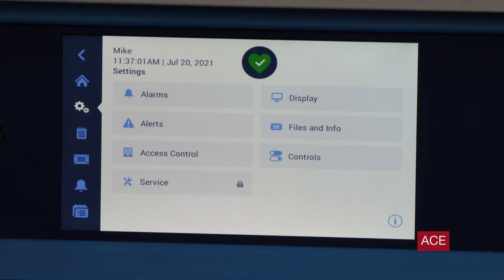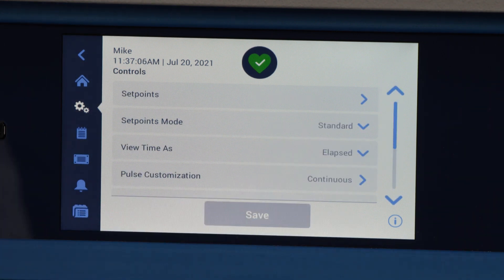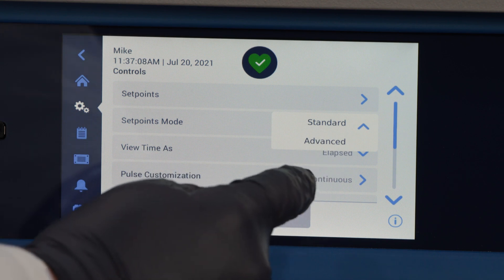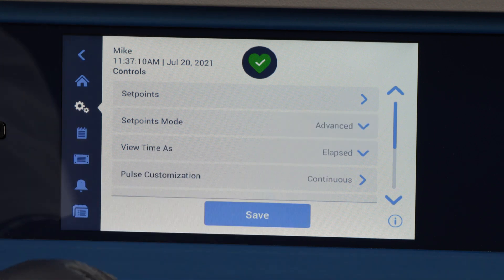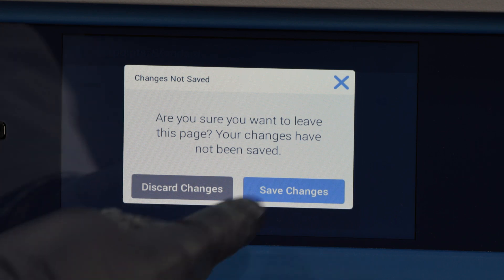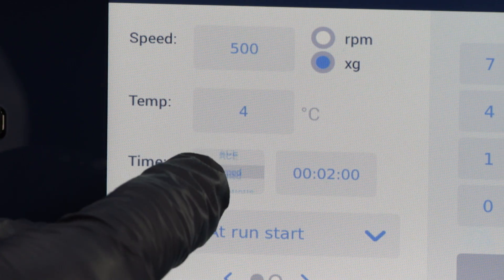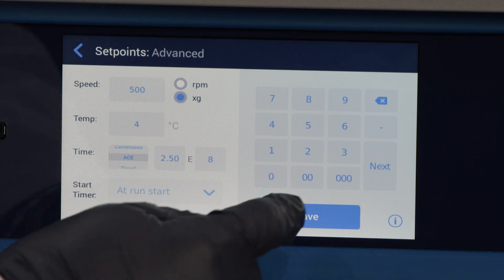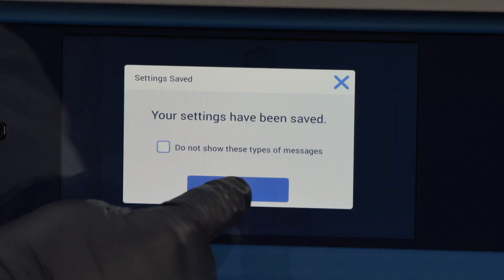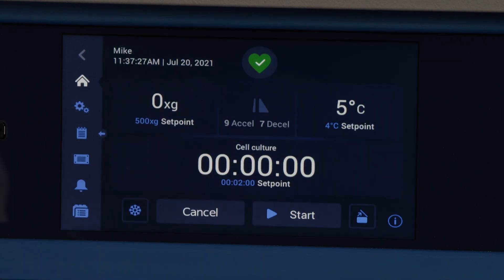The ACE feature is an integrator function that calculates the effect of speed in relation to time and adjusts runtime to account for differences in acceleration. This mathematical model helps you to transfer applications and their parameter settings between centrifuges and sample loads. For example, when you transfer an application to a new centrifuge, ACE ensures that the application runs in the same way and yields the same results as on a legacy centrifuge.